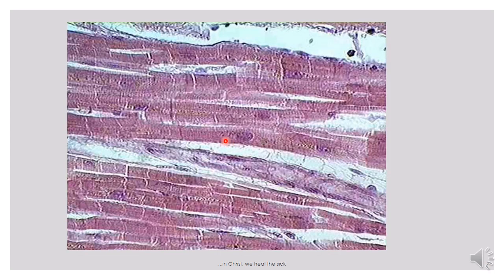The next tissue we are going to talk about is the cardiac muscle. The cardiac muscle fibers are long cylindrical cells with one or at most two nuclei, which are centrally located within the cell. You can see this is a nucleus and this is the cell — it is centrally located, unlike what we see in our skeletal muscle where it is peripherally located. These muscle fibers split or give out branches that join with similar branches from adjacent cells. You can see this particular muscle fiber, when it gets here, it splits so that it can join with the branch coming from this one.